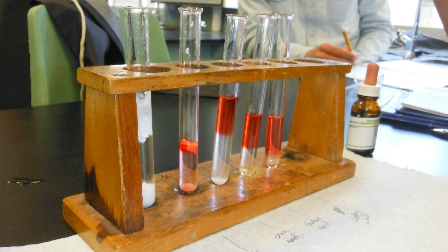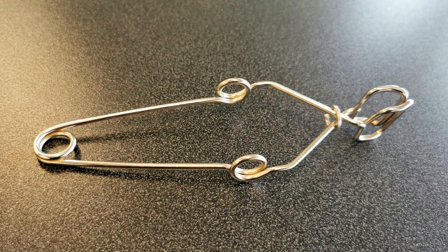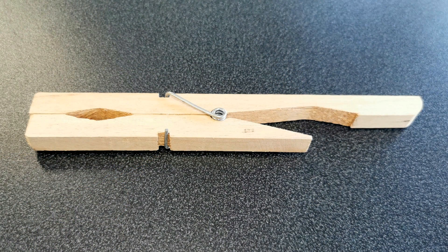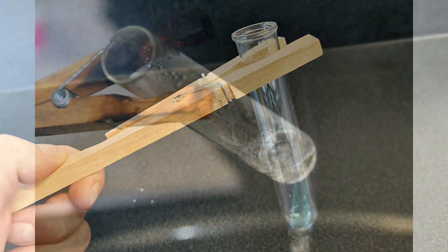Now if you were heating in a test tube, you might not want to hold it — that's okay, we have test tube holders. One variety is a metal variety that is squeezed in the middle and opens the end out so you can hold a test tube. I myself don't really like those ones — I much prefer the wooden peg variety, which does exactly the same job. I think it holds the tube a bit more securely; if the glass is wet, metal on glass can become a bit slippery.